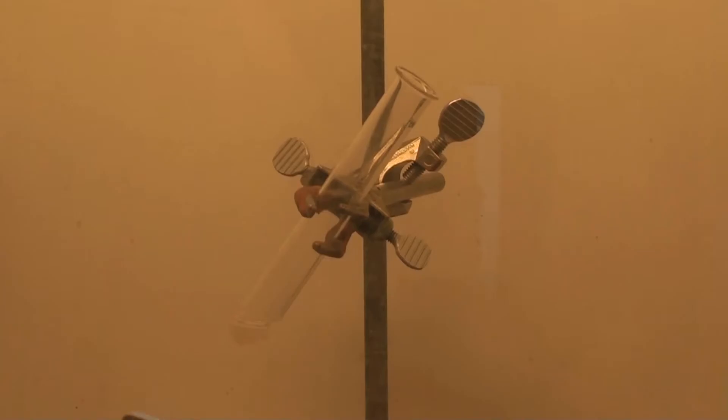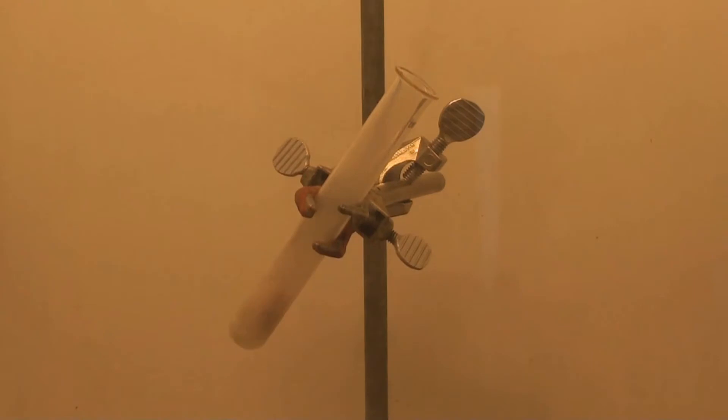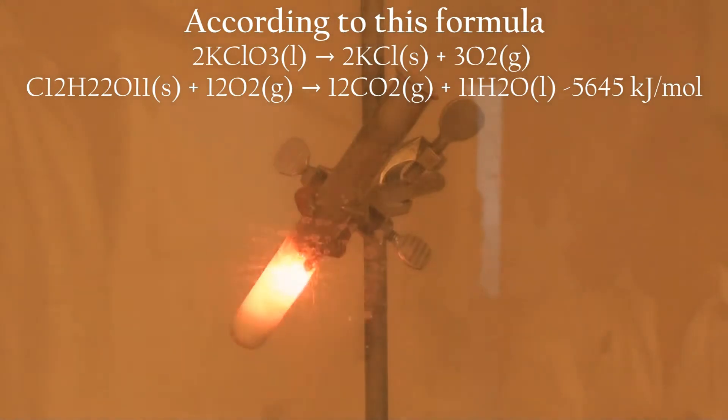Do a last check that you're doing this in a ventilated area, and then you simply add a gummy bear. What happens is simply that the potassium chlorate is reacting violently with the sugar coming from the gummy bear, as it's a strong oxidizer.